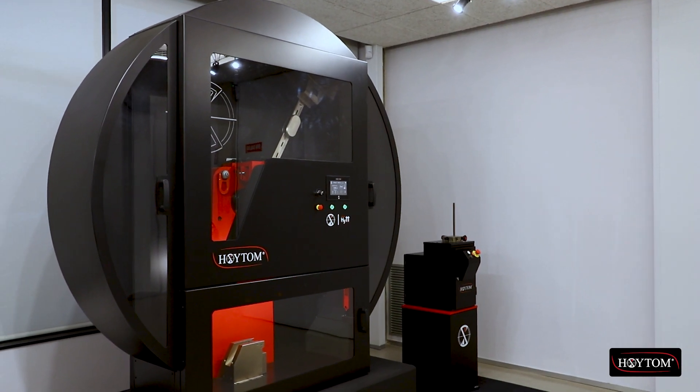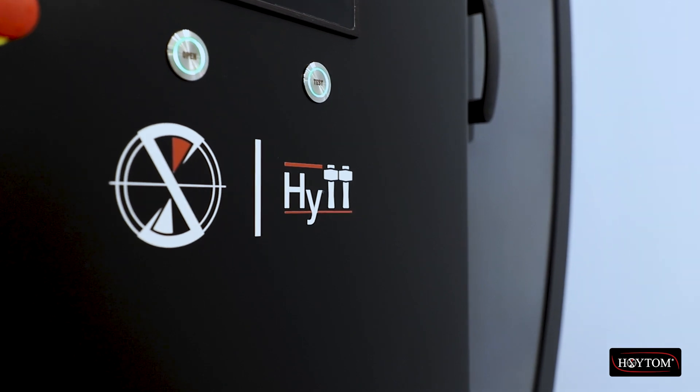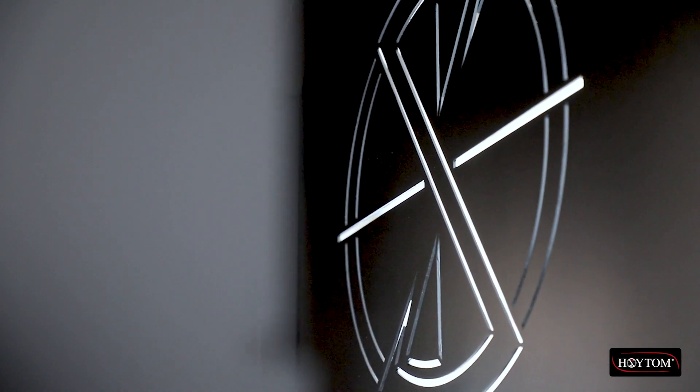Hoytom's HyTT Charpy and Izod Pendulum Impact Tester combines robustness, reliability, safety and design.